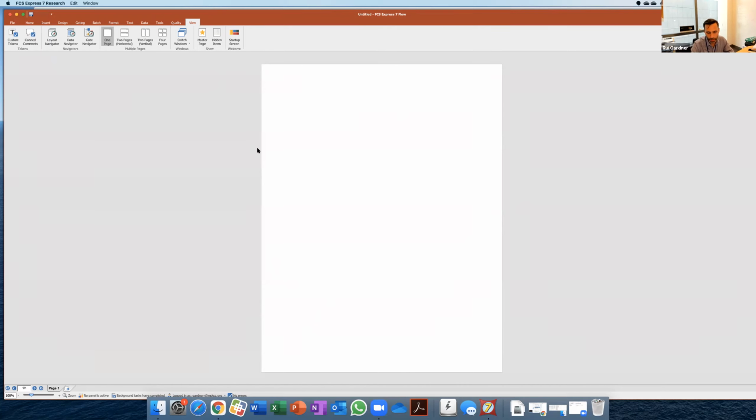Yeah, and I suppose that depends on where you are and who you are. Exactly. So, a lot of, I think mostly because at least at the basic, all the things we're going to do here at the basic level. And when I say the basic level, probably 98% of people doing flow cytometry analysis are only going to cover the essential, the basic functionalities of flow cytometry analysis. At that level, I would say both software just work very well. It might be just a question of preference.